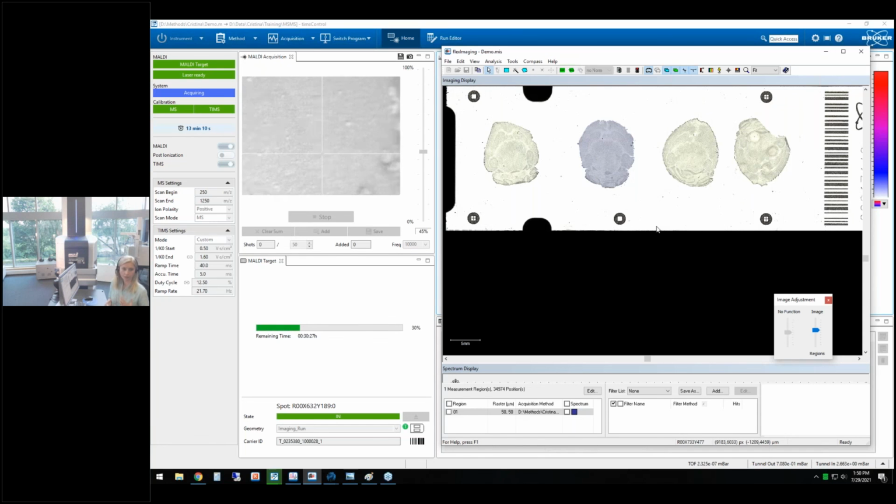It can perform a wet matrix deposition or a dry matrix deposition by adjusting the method parameters. And we also can spray enzymes for in-tissue digestions, including trypsin or PNGase F. We spray the enzymes uniformly and then perform the incubation. And when the digestion is done, then we can use again the TM Sprayer to deposit the matrix as well.